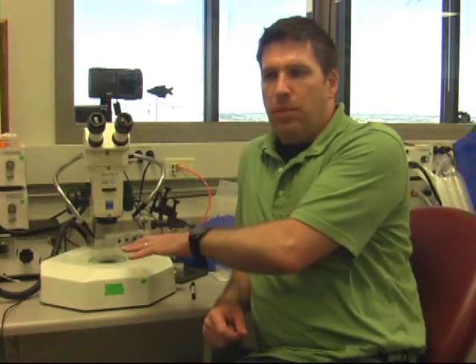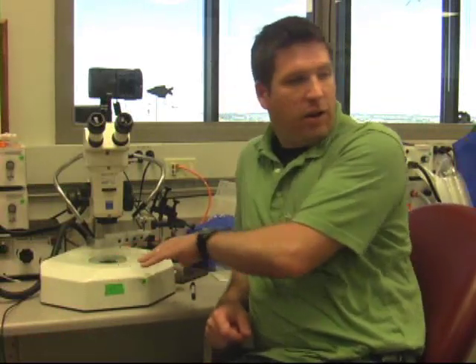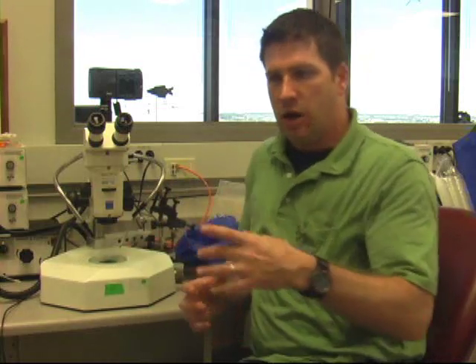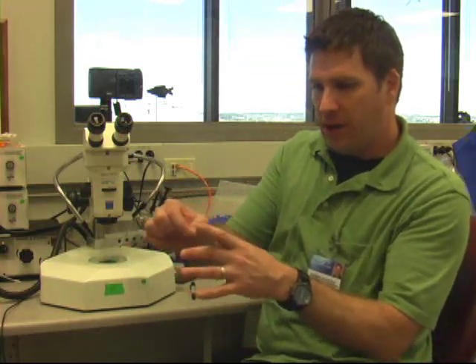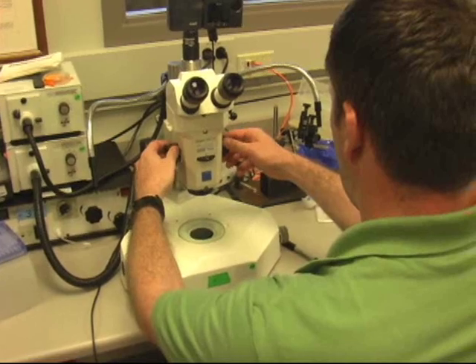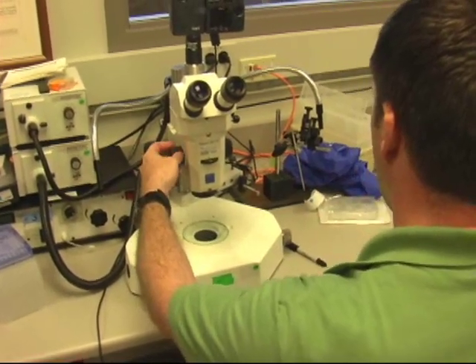The working space is a major difference between what we've got here and what we were using originally, because with the other scope the objective would come down and get caught up in the petri dish. So we've got the stage here, and this is going to adjust the magnification right here.